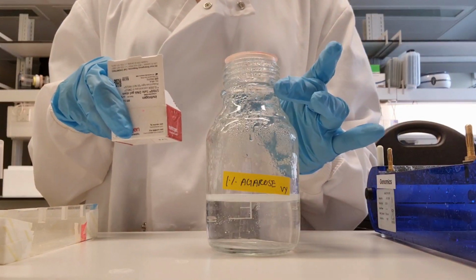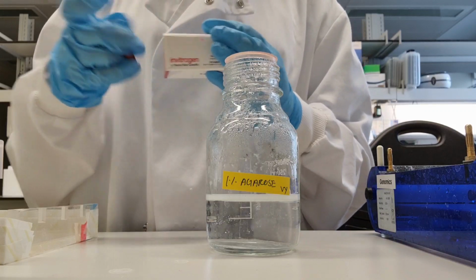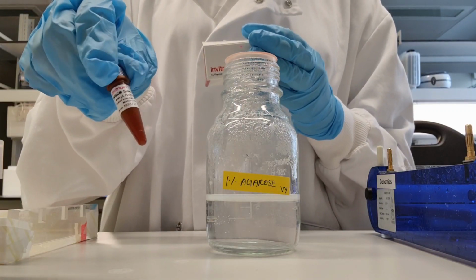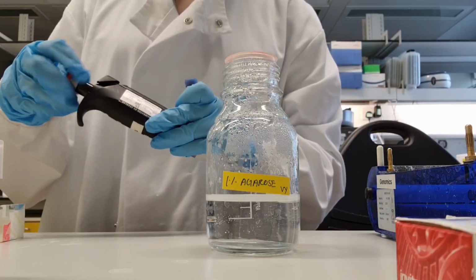So now I've just finished making my 1% agarose gel. In order to later visualize your bands on the gel, you need to add a bit of SYBR Safe green dye, so I'm just going to add this in a 1 to 10,000 dilution.